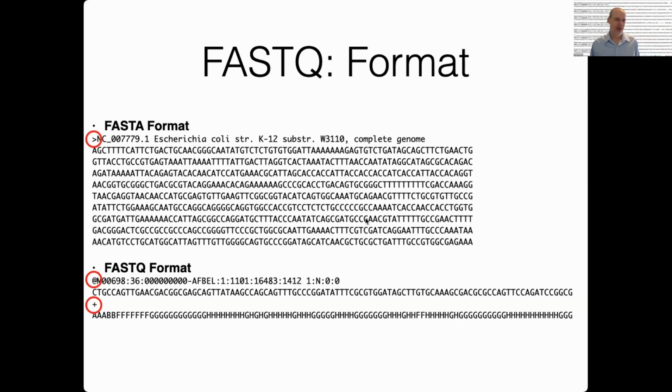I'm not going to get into details about what exactly you need to do, but you need to be a little bit more thoughtful about parsing FASTQ files. I never write FASTQ parsers because there are existing ones that you can use for all the programming languages that I use.